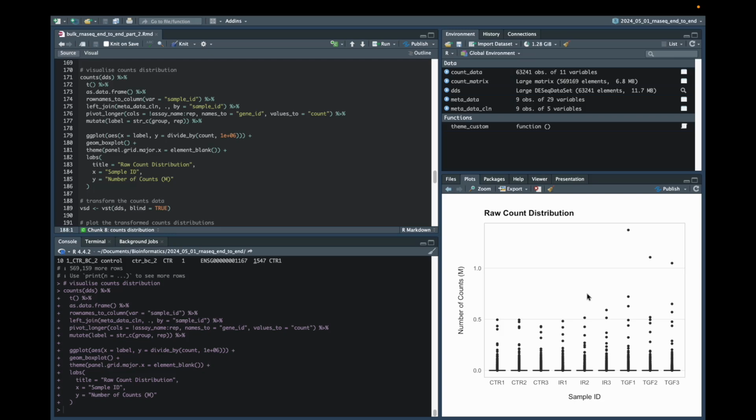Now, genes with high absolute counts can introduce a lot of variance, making it challenging to detect the true differences in expression for genes with lower counts, and this is why transformation techniques such as log transformation or variance stabilizing transformations are often applied to RNA-Seq data before downstream analysis. In DESeq2, the VST or rlog functions can be used to transform the data and compensate for the effect of different library sizes, and the effect of these transformations is to remove the dependence of the variance on the mean average and the high variance of the logarithm of count data when the mean is low.